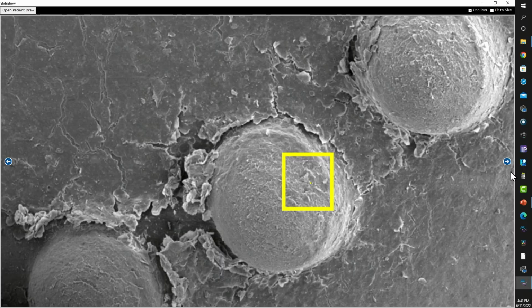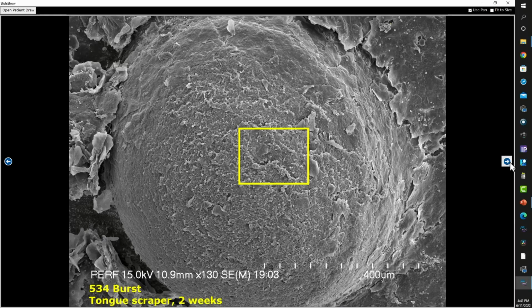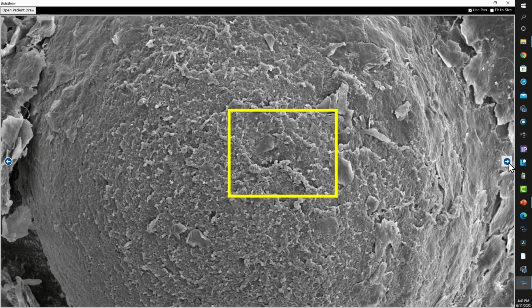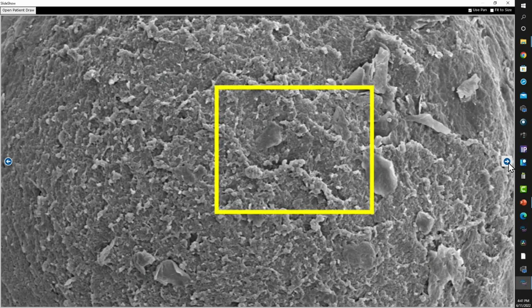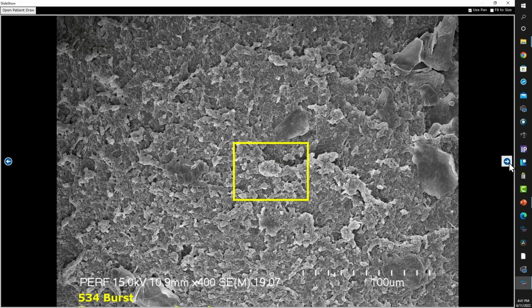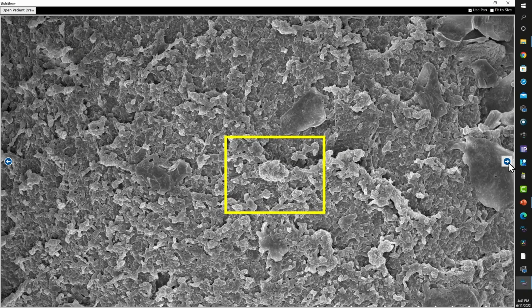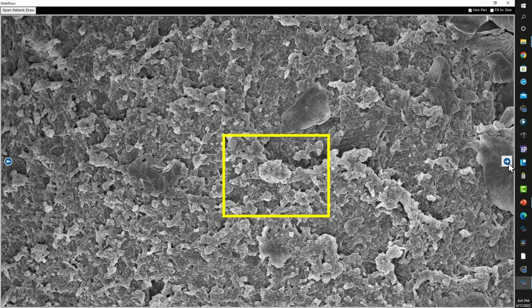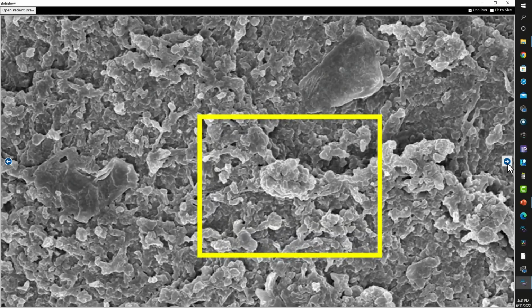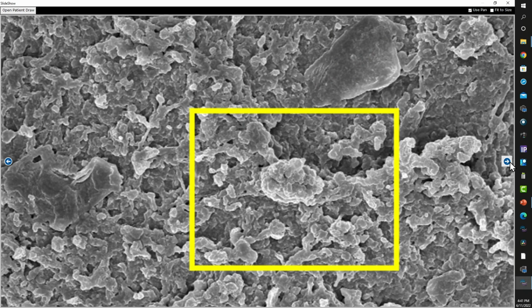When you actually look at the domes on it that probably have most of the stress on the surface, you gain a different sense for how protective this EPS actually is. And we go in and look at these. Sometimes it's hard to even tell that there are organisms.